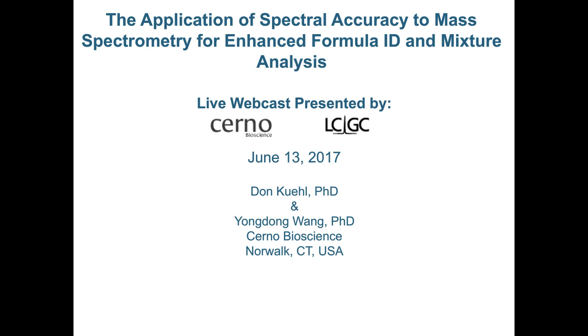How stable is the calibration for a quadrupole MS mass spectrometer, and how often do I need to recalibrate?